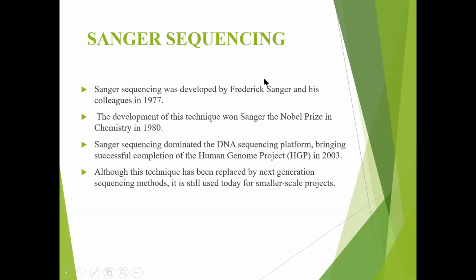Good afternoon, all. Yesterday, we started discussing DNA sequencing methods. Before that, we discussed four major developments that enabled us to sequence a given fragment of DNA. We discussed all those four developments. Then I also mentioned that there are two important methods of DNA sequencing.